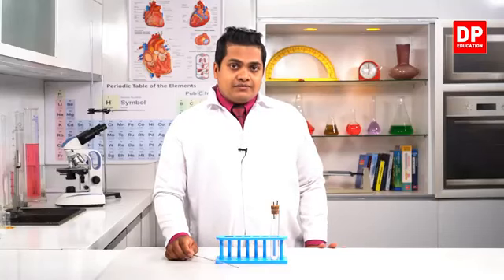Because at the end we'll be comparing our observations one relative to another. So to check whether we have got the necessary observations, we need to make sure that these boiling tubes are of the same dimensions.